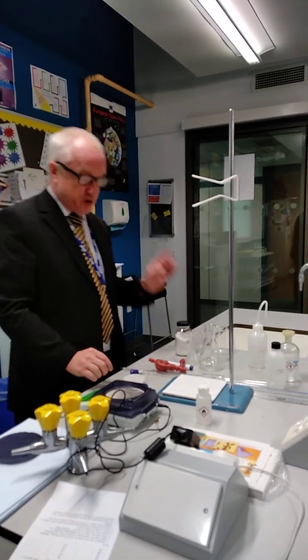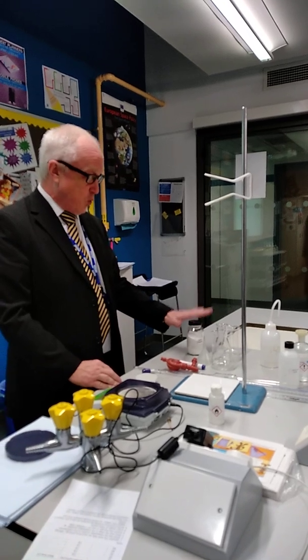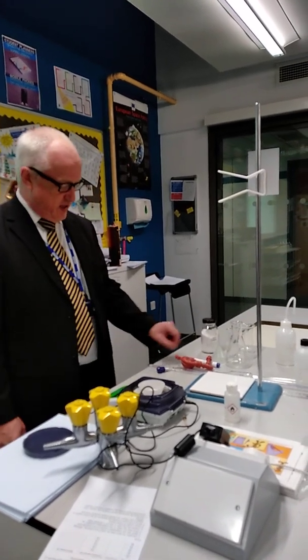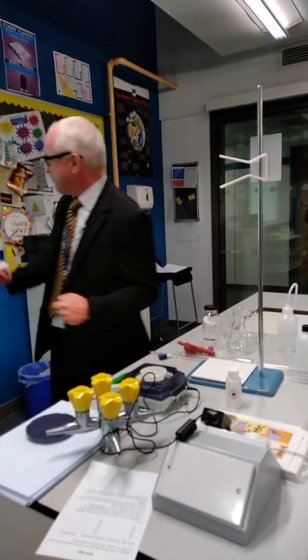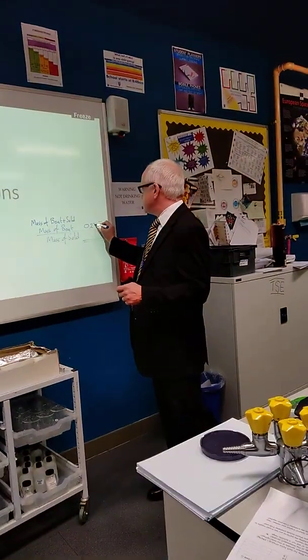The way we're going to start off is we're going to weigh out approximately one gram of this, but we're going to weigh it by difference. So we're going to take our weighing boat, put it onto the balance, and we're going to get a mass of 0.27 grams. So the mass of the boat is 0.27 grams.